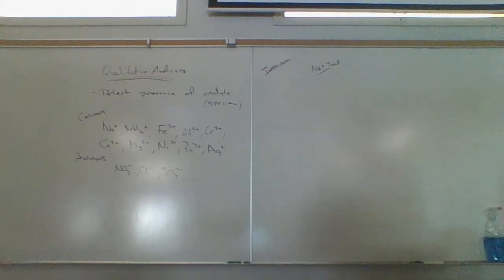And so we could try washing it off with DI water. But it's still going to be hard to wash off all the sodium. So I just wash that off. And do you see there's still color in there, in the flame? And so what we need to do is a combination of washing and then acid rinse and then burning. And ultimately you're just going to burn off the sodium off the metal here.